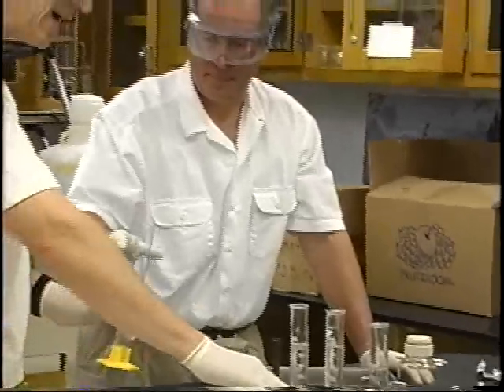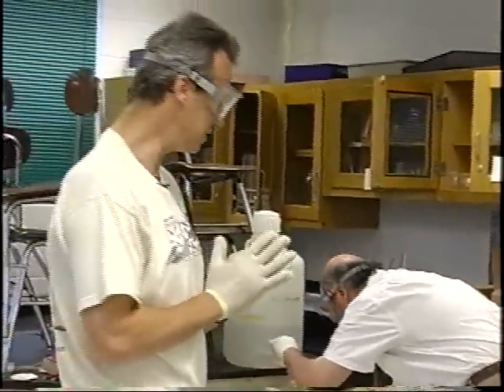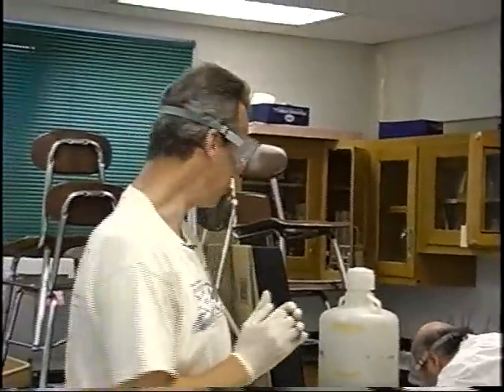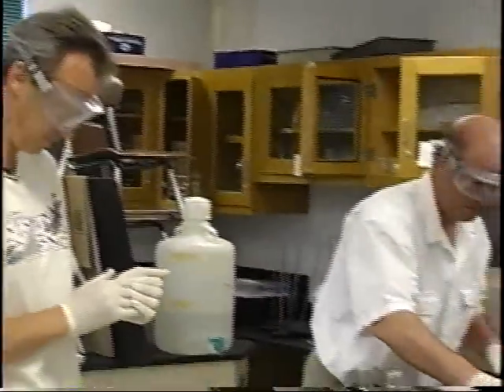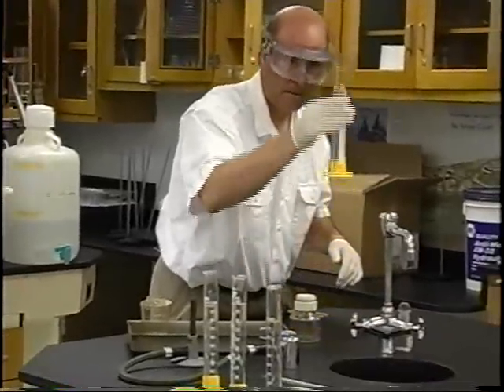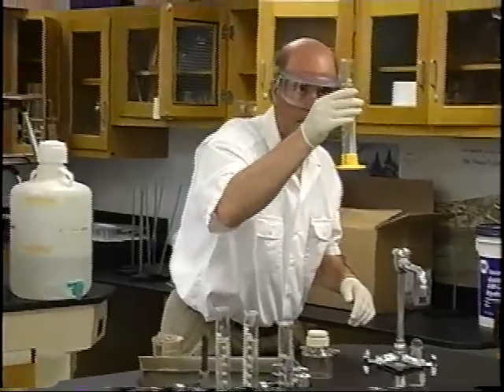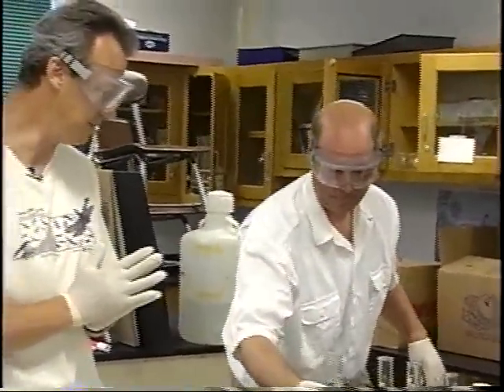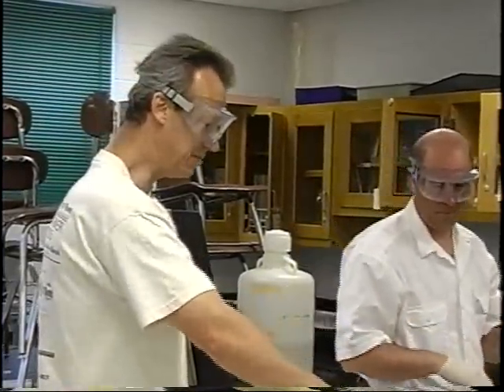All right, so I've got 3 concentrations of river water. Any good science experiment has a control as well, so Mr. Piskel once again is going to town on that deionized water bottle. So we're now going to have 4 samples, 1 control, and then 3 different strengths of river water. And what we're going to do now is show you what your classmates would be doing at the same time you're doing this. And then we'll show you how to filter these and get the bacteria on the filter paper, and then we'll incubate it.